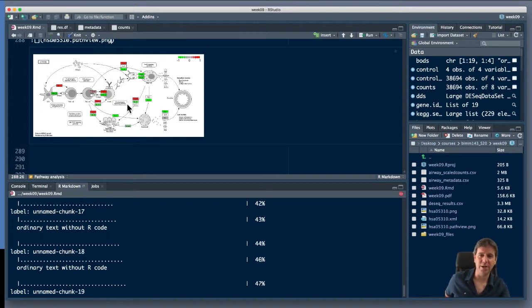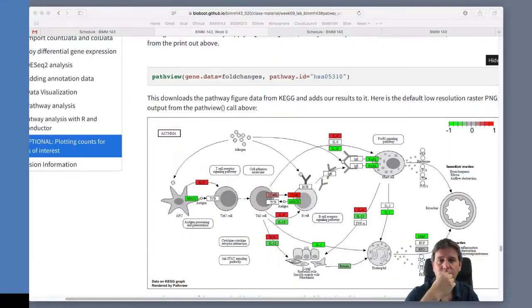So it's running the analysis step. We're nearly halfway there in the last half, pretty straightforward. So while this is finishing, it's approaching the end of that 50% mark. I'm going to pop over here to look at the workbook.